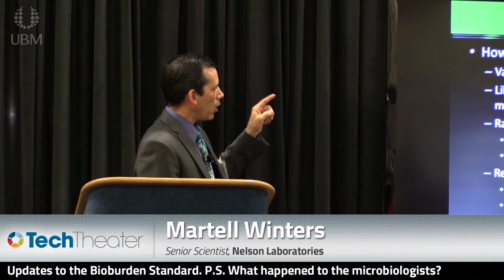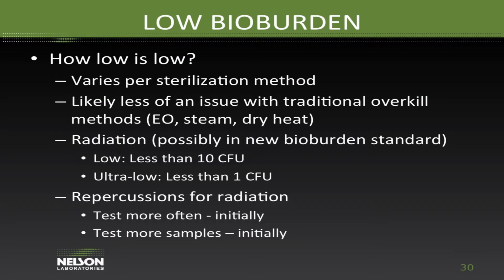Now, low bioburden, what repercussions does that have speaking for radiation? Radiation is a bioburden-based method, so your radiation dose is tied quite closely to your bioburden count on your product. So that means for radiation, you might have to test more samples initially than the normal data sample set, and you might have to test more often if you have low bioburden, so that you can prove maintenance of that low bioburden until you gather a really good history.